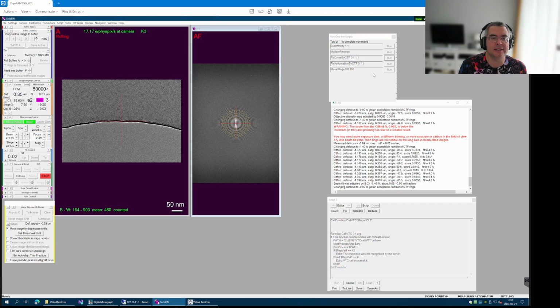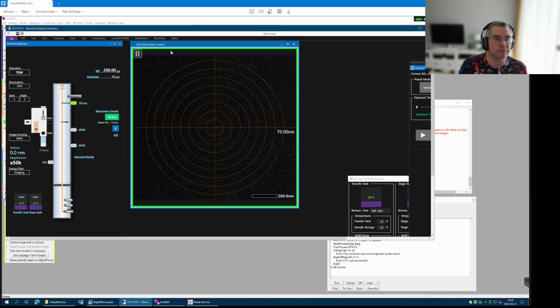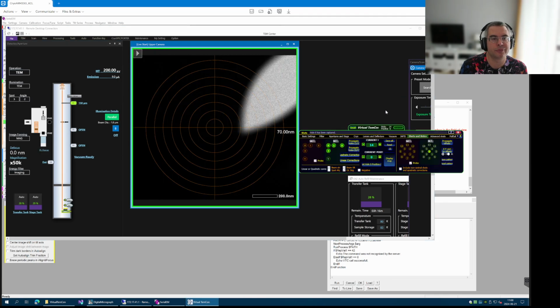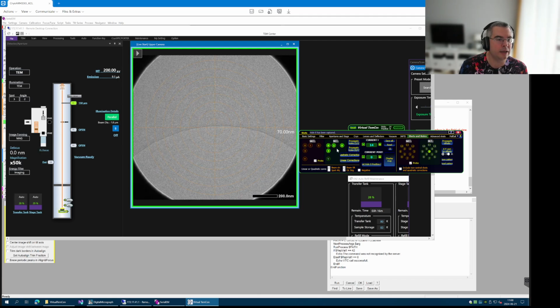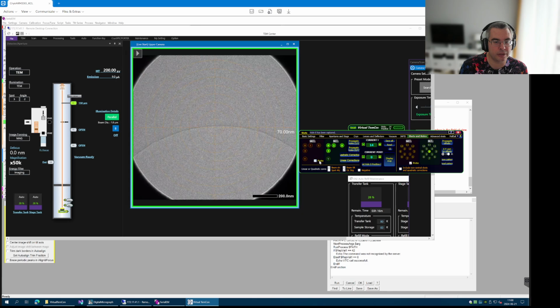Then we have to fix the astigmatism. So here we go. Done. Then we need to check the beam position. And the beam position is okay. So I can unprotect the getters. I hope so. Yeah. Sorry, the connection is quite slow. So unprotect the getters and get this hole now as hole Y.